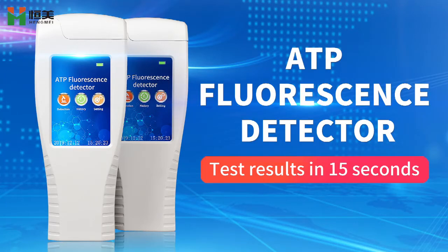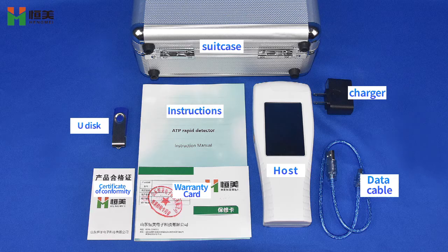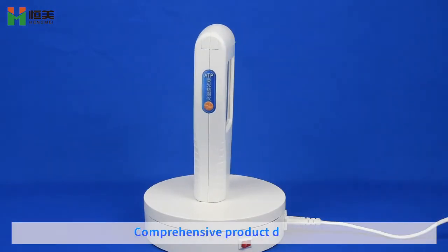Apophorescence detector. Test results in 15 seconds. Comprehensive product display.